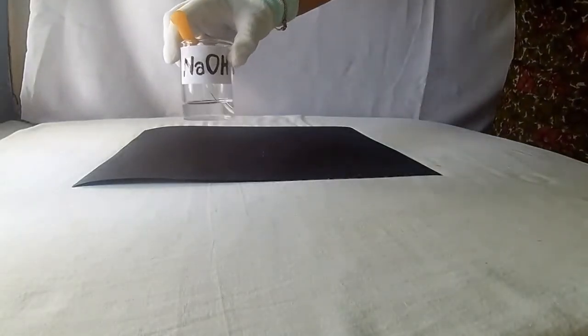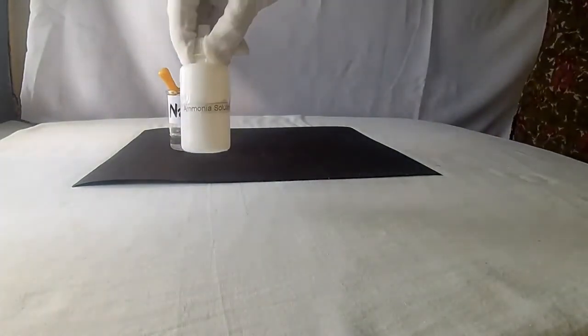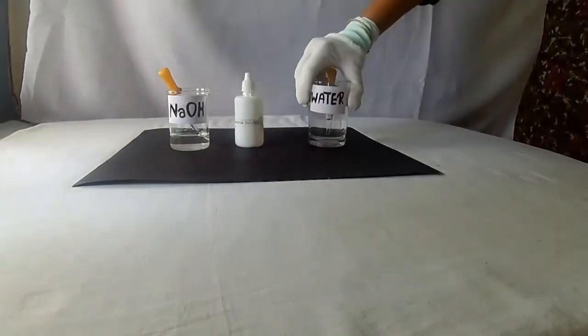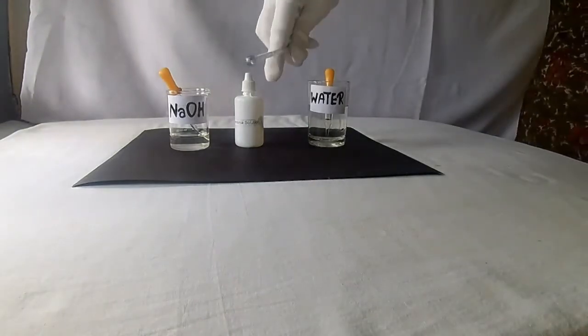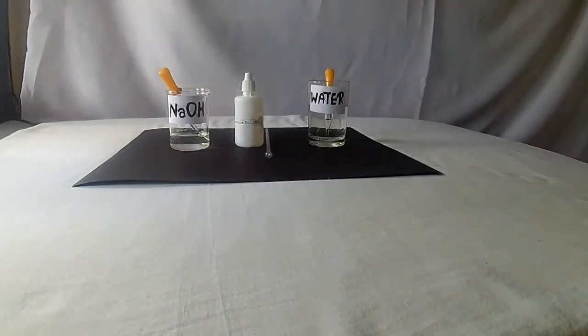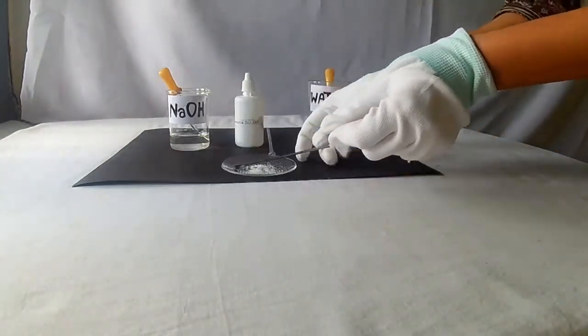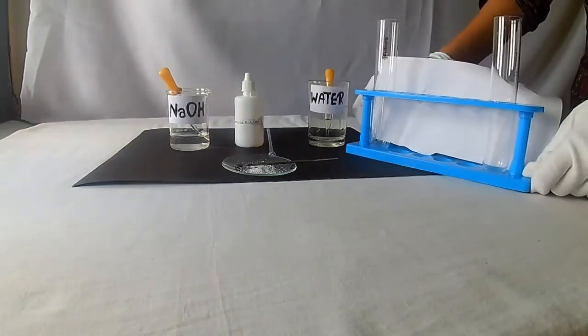Take sodium hydroxide solution, ammonium hydroxide solution, water, glass rod, zinc sulphate salt. It is a white crystalline salt. Two test tubes.